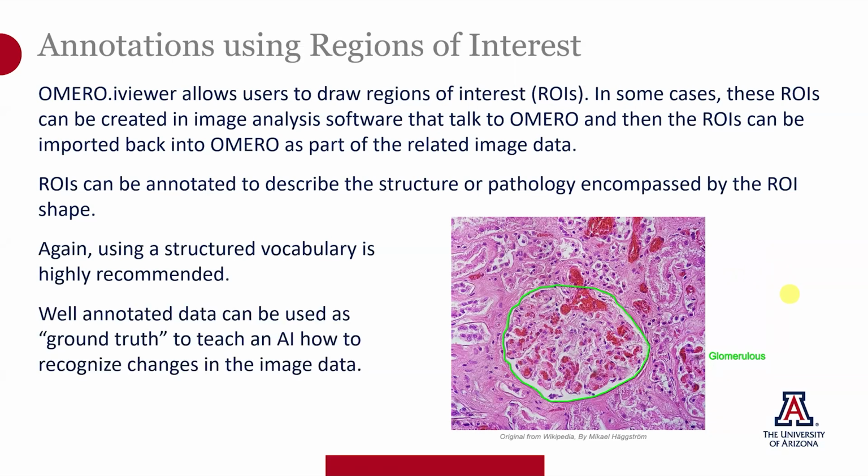Again, using a structured vocabulary is highly recommended because if you plan to use AI to analyze your data, it's critical that the training sets contain well-annotated data so that they can serve as the ground truth, essentially to teach the AI what it is that you're looking for.